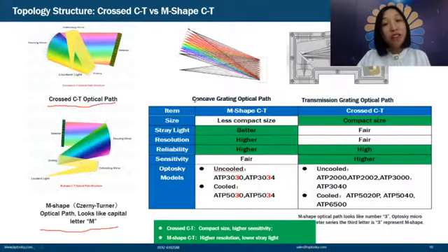And we also have a concave grating optical path. The light shoots in here, and the grating can disperse and also focus the light to here. This is a very simple optical path.